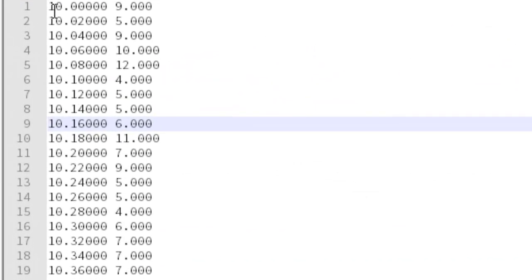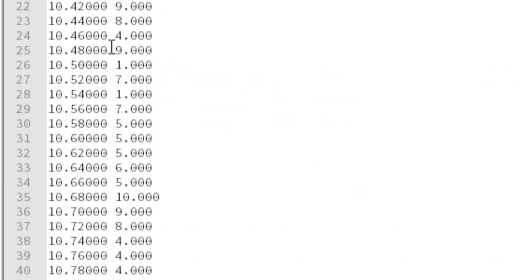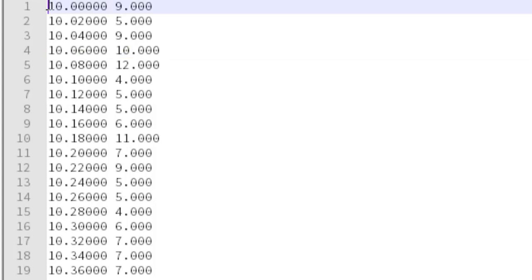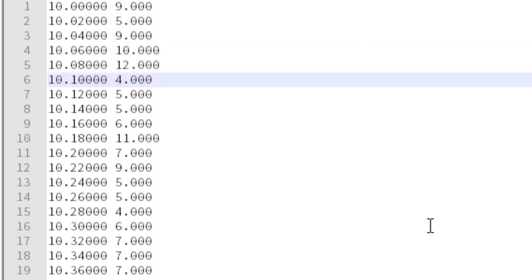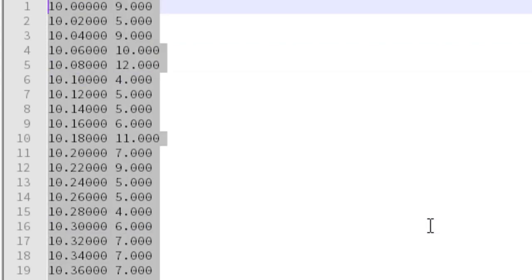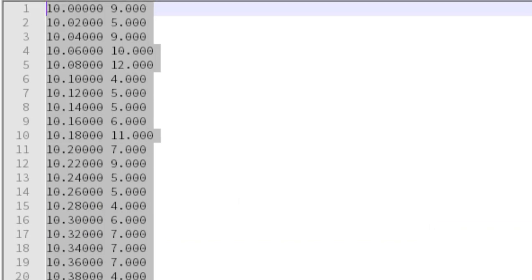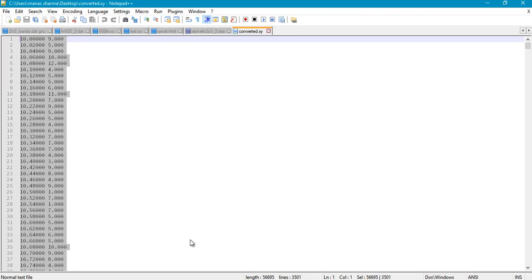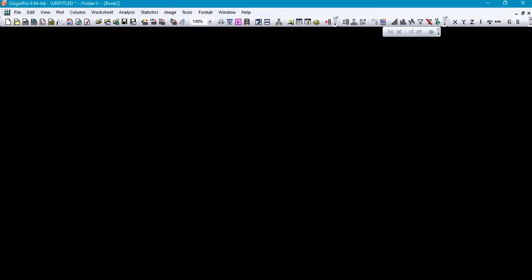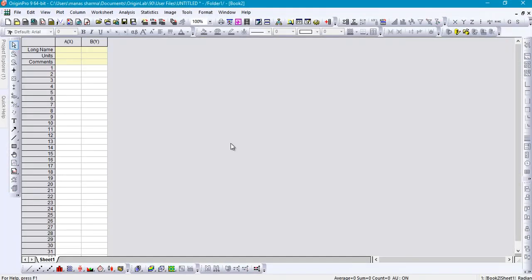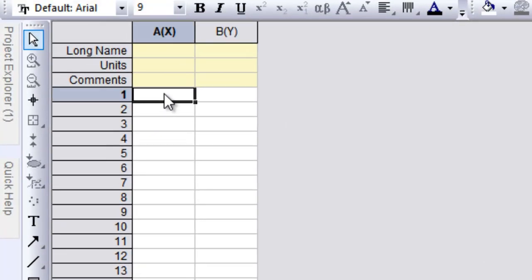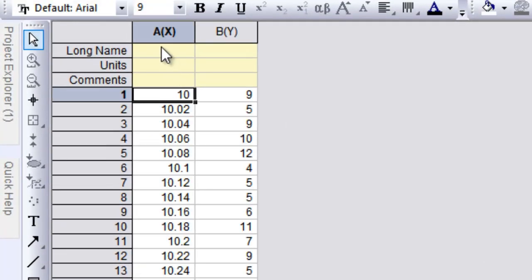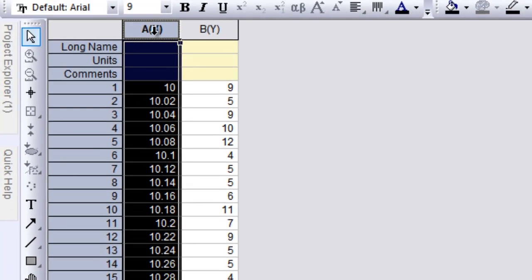You can open it using any text editor and here you have the data sorted into two columns. The first column denotes the x-axis values while the second column denotes the y-axis values. What you can now do is select all this data and copy it into any suitable software of your choice and plot this data to see if the XRD pattern is meaningful. I'll be using Origin for that. I'll just go ahead and open Origin and paste all this data here and plot it.